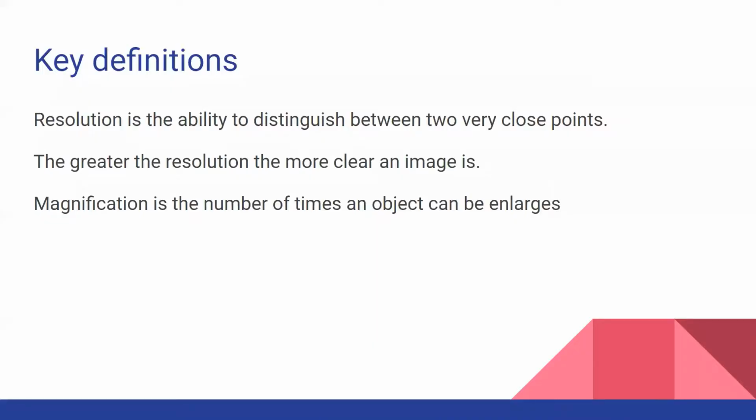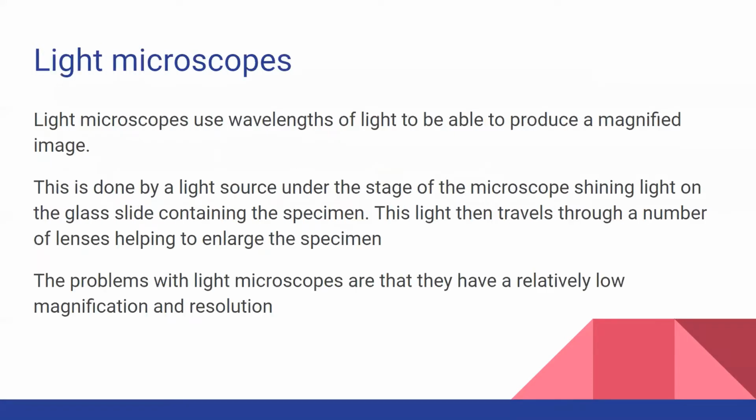Some key definitions that we need to know is that resolution is the ability to distinguish between two very close points. The greater the resolution, the more clear an image is. Magnification is the number of times an object can be enlarged.